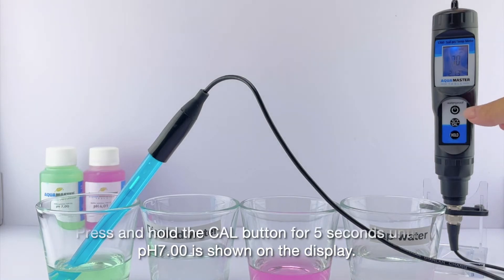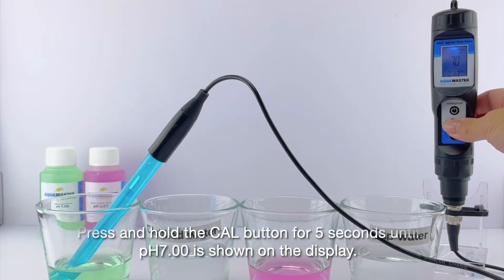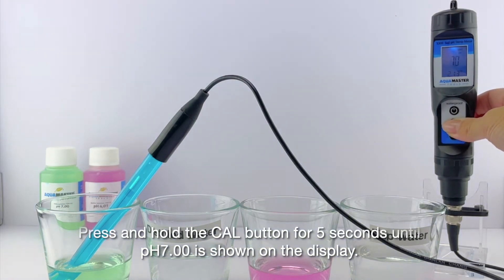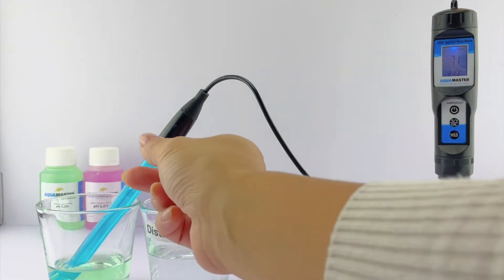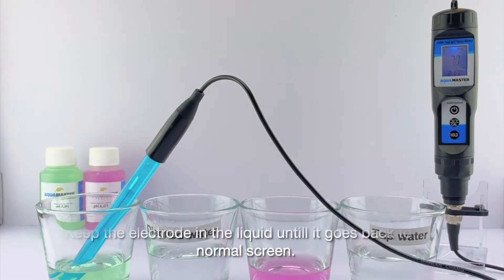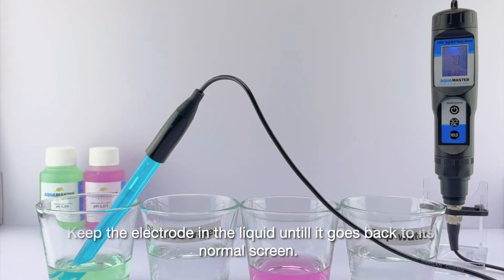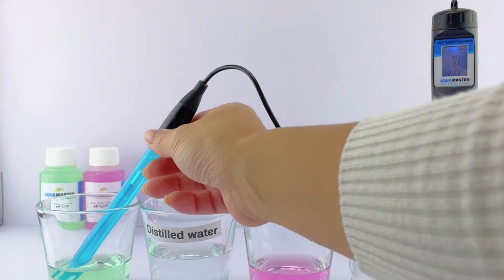Press and hold the calibration button for 5 seconds until pH 7.00 is shown on the display. Keep the electrode in the liquid until it goes back to its normal screen.